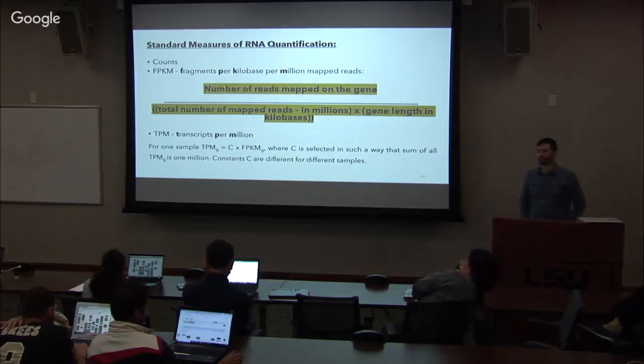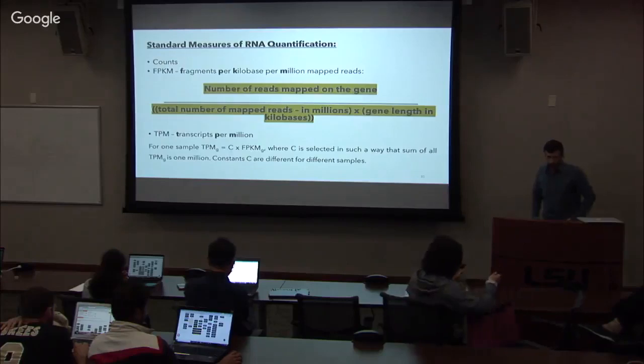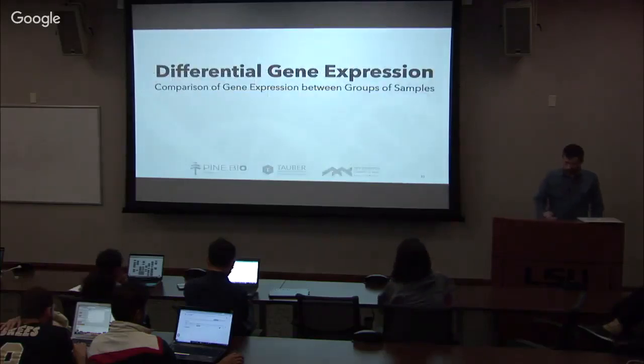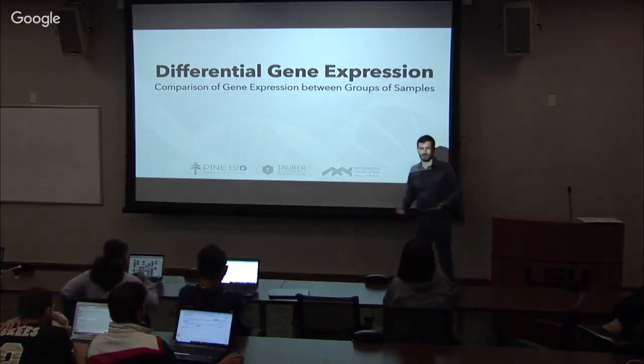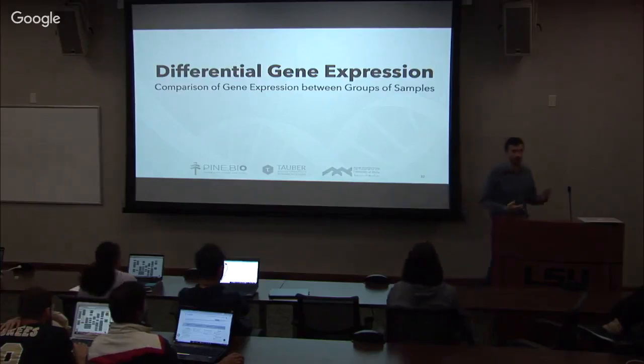Any other questions? Okay, so next we want to talk about differential gene expression. So now we have a sense of what is in the expression table. How do we compare between two groups of samples?